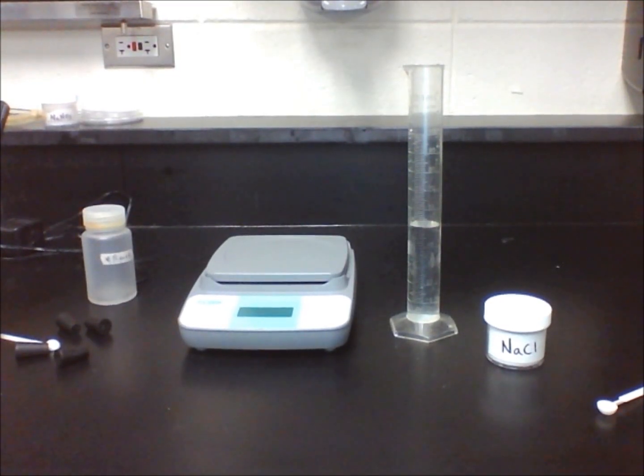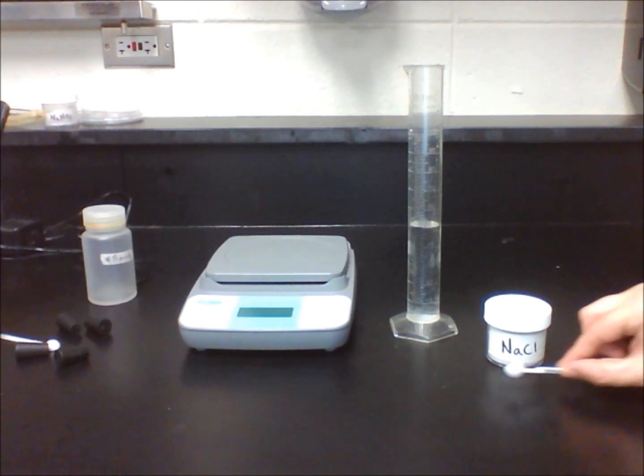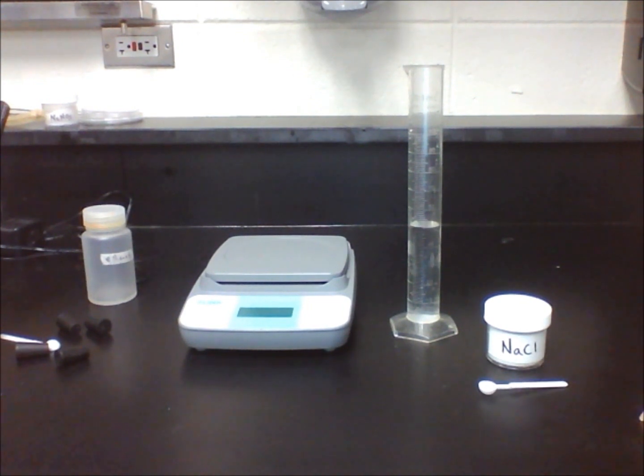In lab 14.2, we are going to design a lab to determine what happens to the mass of sodium chloride or salt and water when salt is dissolved in the water. We can do this by finding the mass of a total system and seeing if it changes or stays constant.